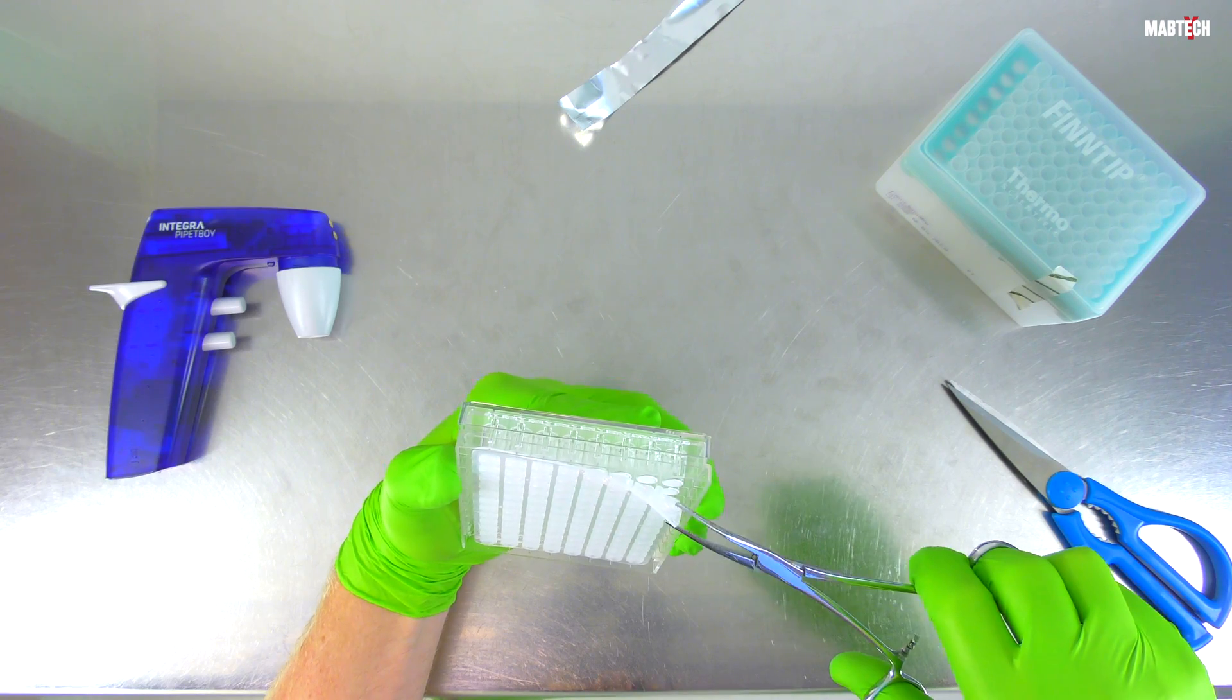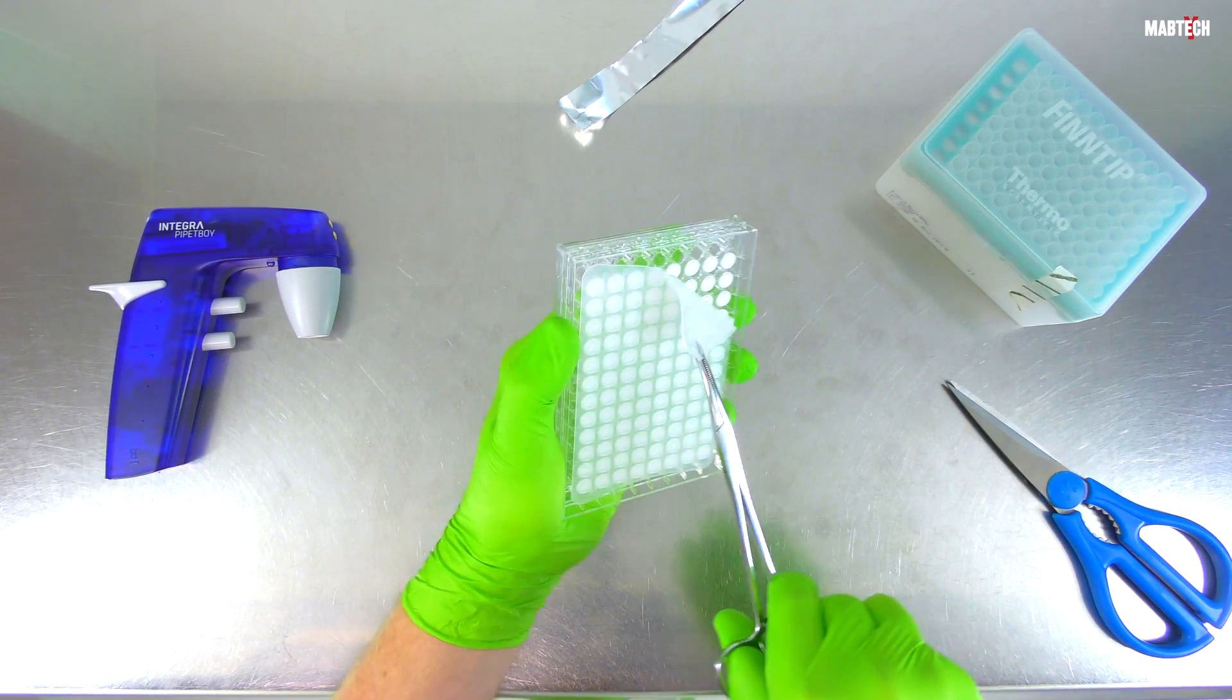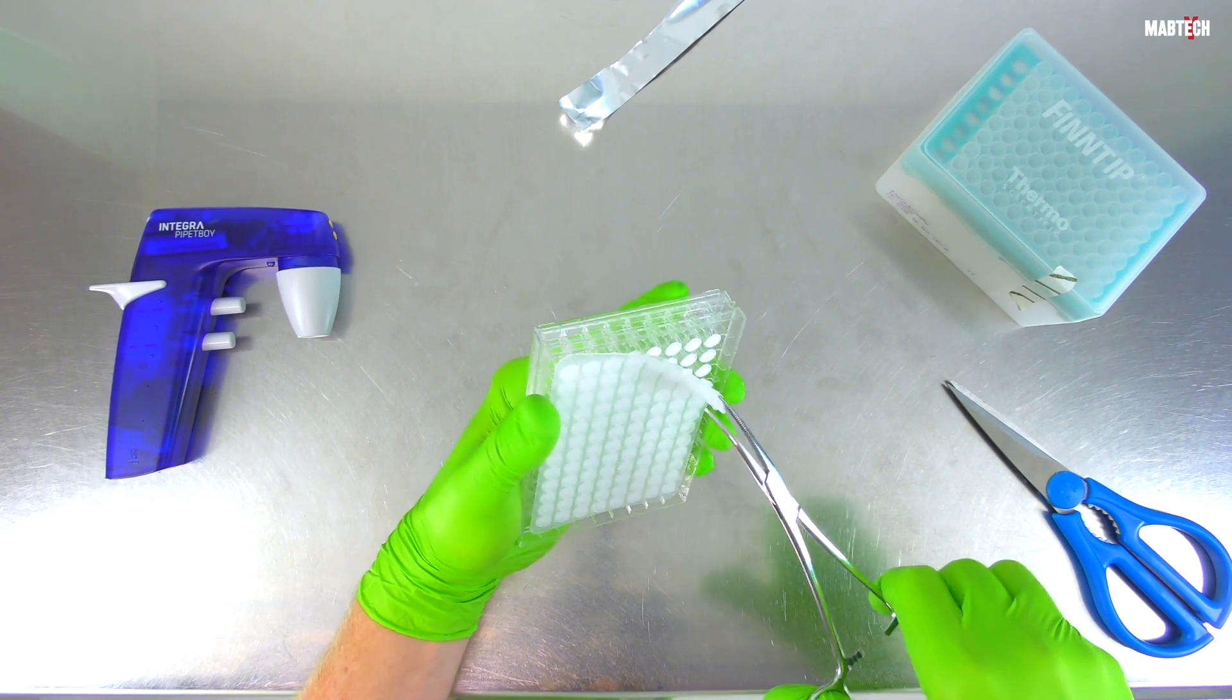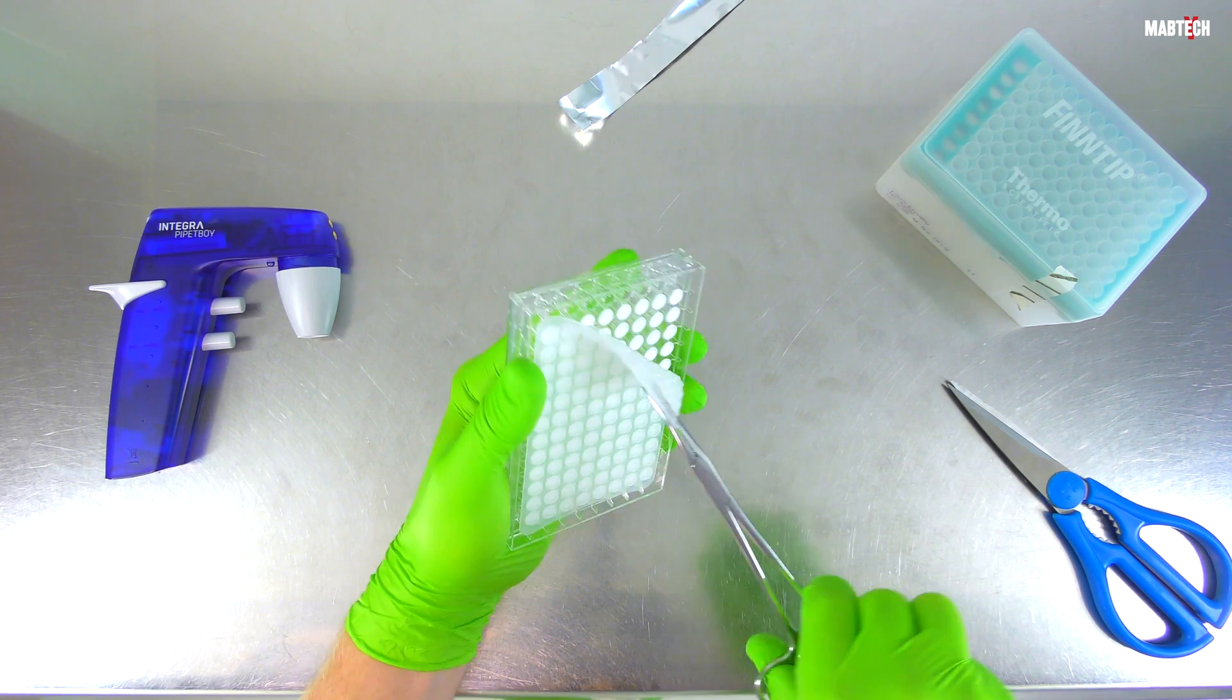This is very important because simply pulling straight and hard can make the ELIspot membrane rupture. We don't want that. Furthermore, notice how the technician is holding the plate, not putting any pressure on the backside of the underdrain.